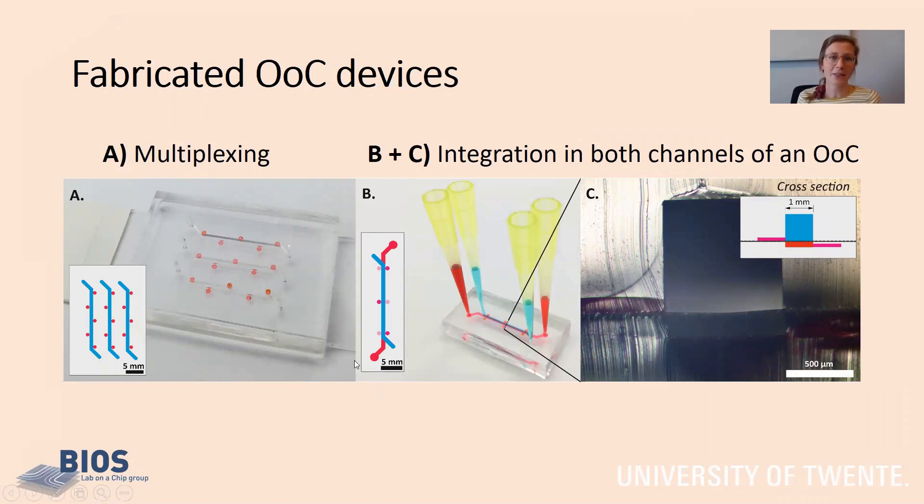We show that the method allows multiplexing — the patches can be placed at any desired site in the mold — and we show the integration in a typical organ-on-chip. This organ-on-chip consists of two parallel channels separated by a porous membrane, and we integrated sensor patches in both the top and bottom layer of the organ-on-chip, and also along the channel. This allows us to very specifically measure the oxygen concentration at various sites in the organ-on-chip.